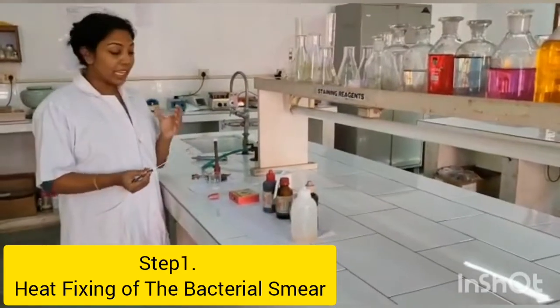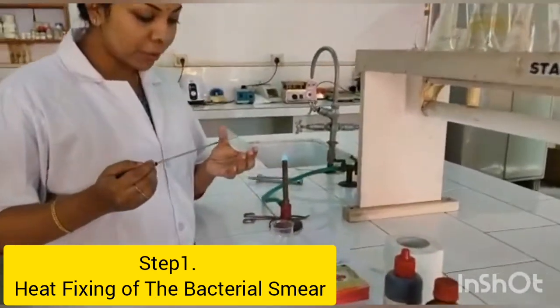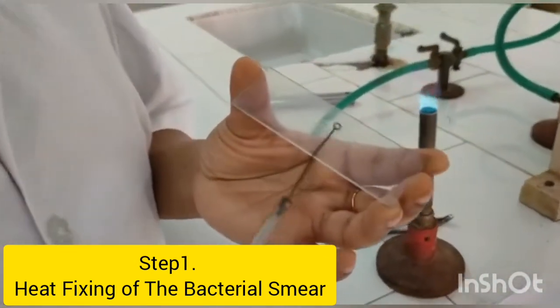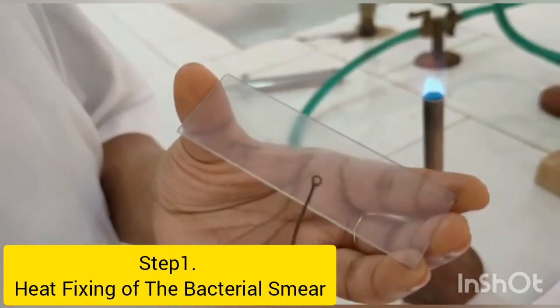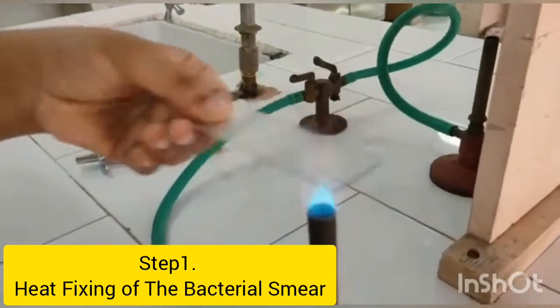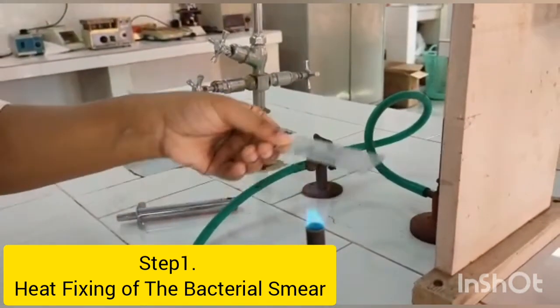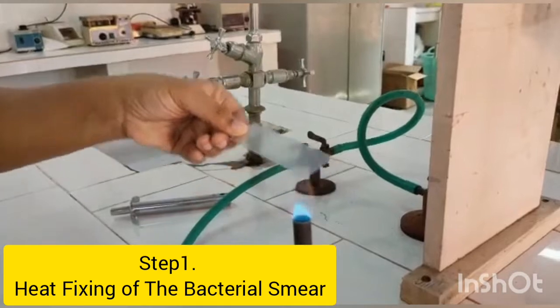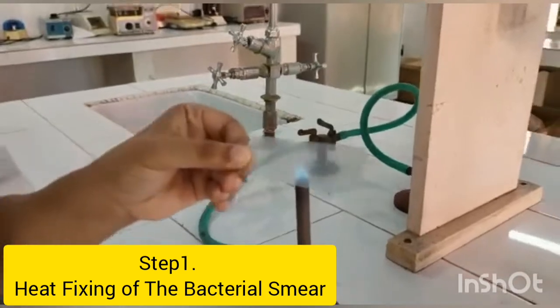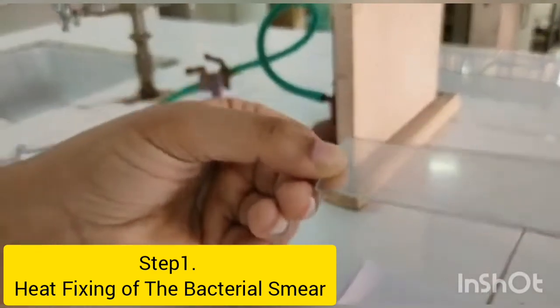The first step is the heat fixing of the bacterial smear. For that, you have to take a loopful of bacterial culture and make a smear. Then you have to fix it by passing the slide over the flame. Now the smear is fixed. We have heat fixed it, so allow it to cool for some time.